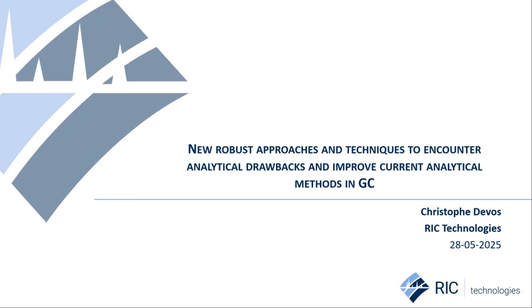My talk will be mainly related to GC sample introduction and injection techniques, pointing out some recent developments related to the analysis of volatiles, but also to the current methodology we use to improve sensitivity when doing liquid injection. And this more specifically applying large volume injection within routine analytical methods.